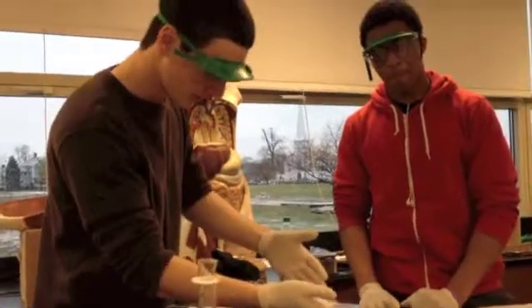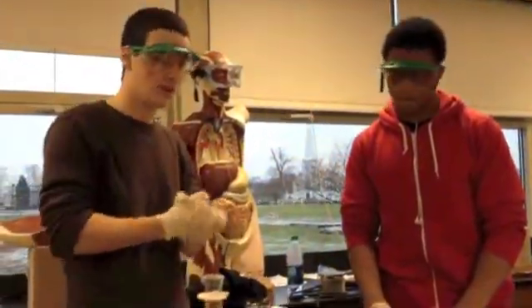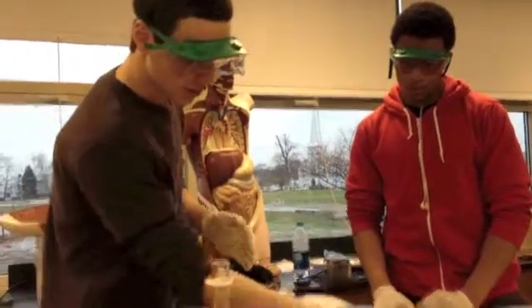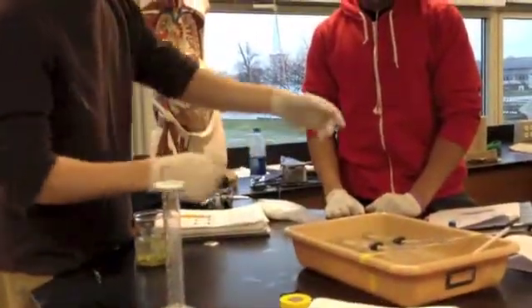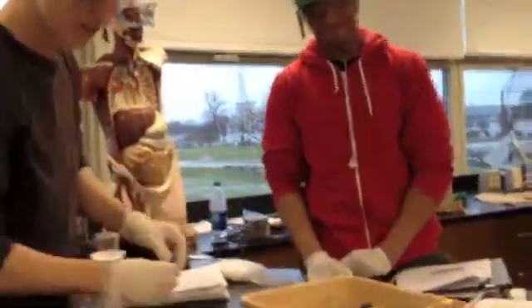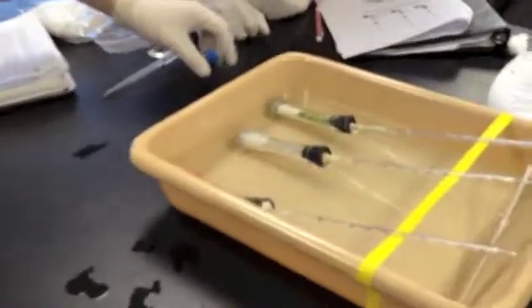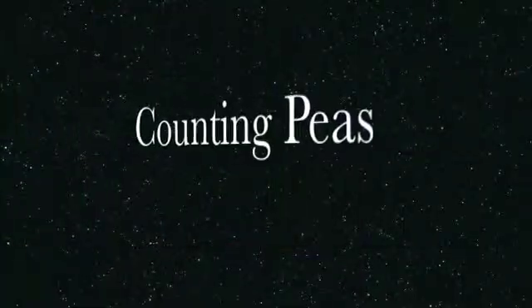We had just placed our pipettes in the water for our seven-minute equilibrium period. After the seven minutes, we will then move the tape and put food coloring at the tip of each pipette. We will then drop them into the water and watch cellular respiration happen.